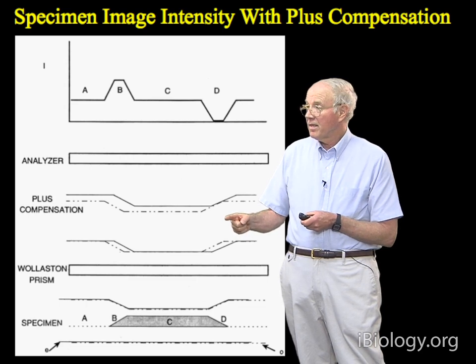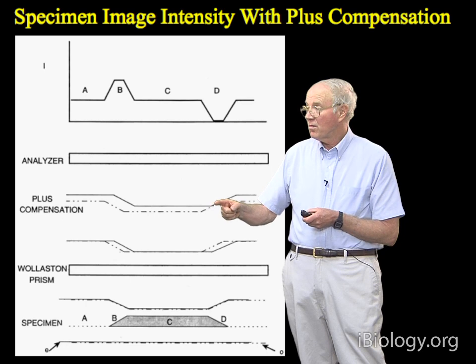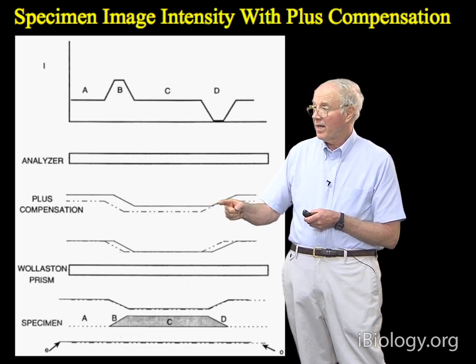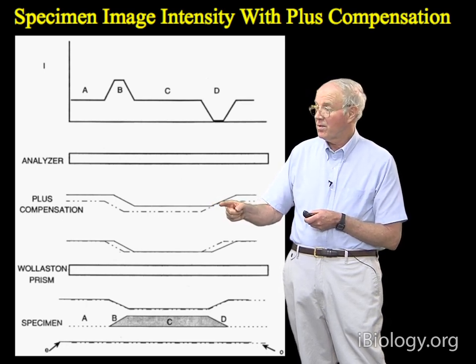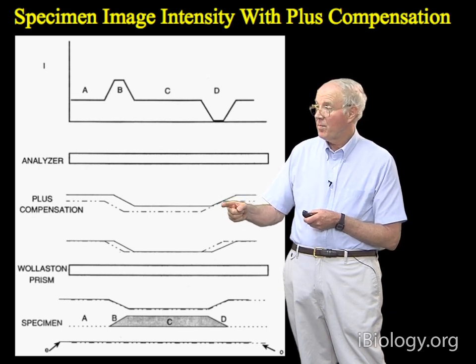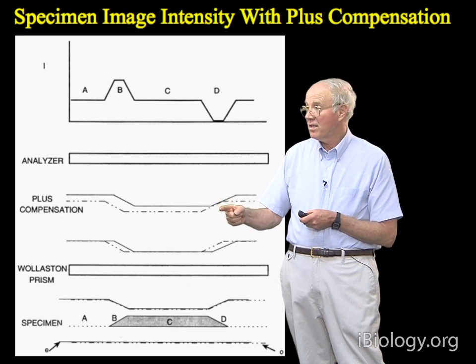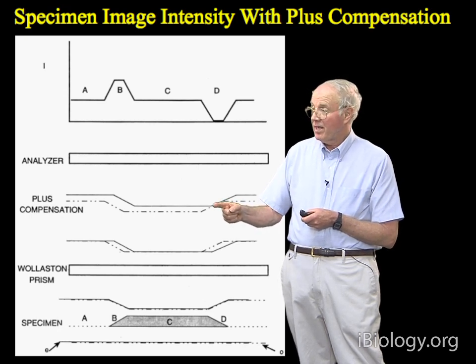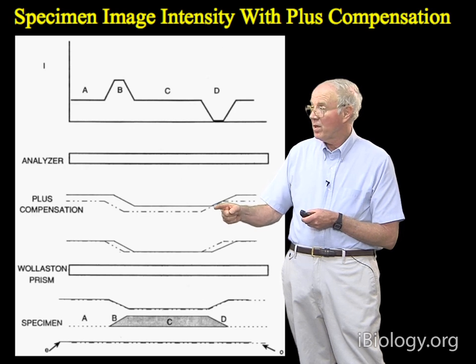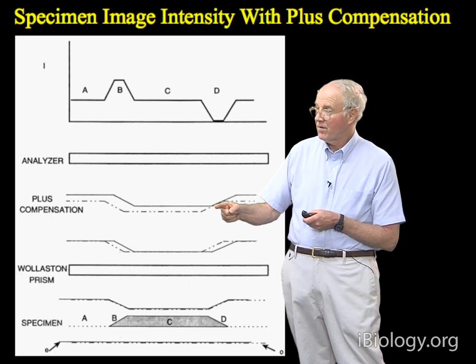And this will now show you why one is dark and one is white. So in the images that we were analyzing to begin with of the microtubules and the particles, we had a compensator in the light path, and the compensator was adjusted such that the right-hand edge here, we were advancing one of the wavefronts over the other so that the right-hand edge essentially has no retardation difference.